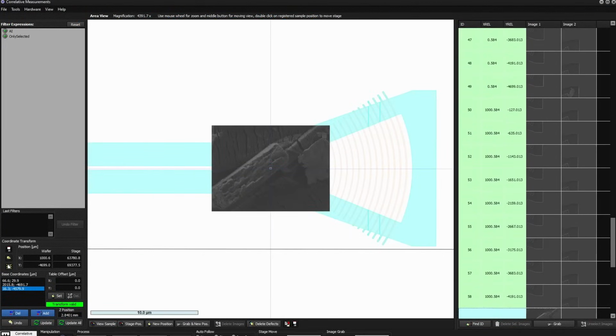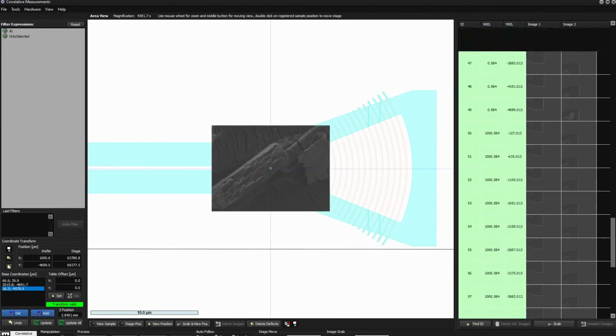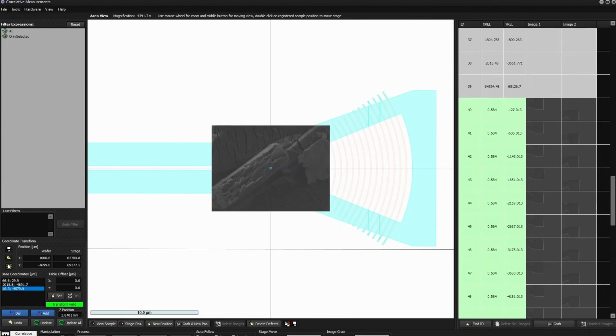You can also see slight differences in the structure dimensions when you scroll through that. But you can see how easy it is to create such still relatively complex workflows. And this is already the end of this short demonstration.